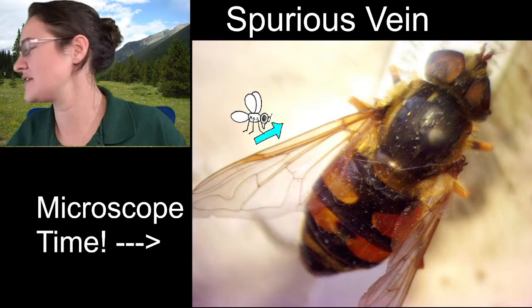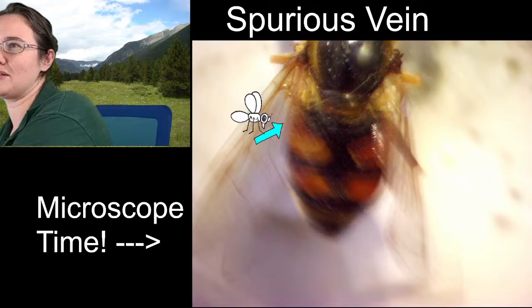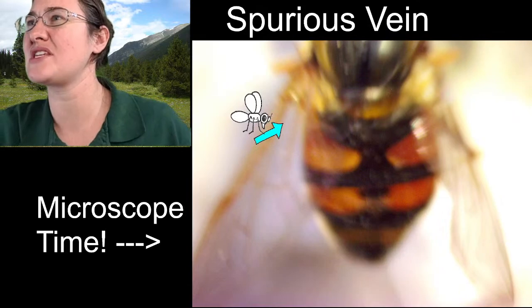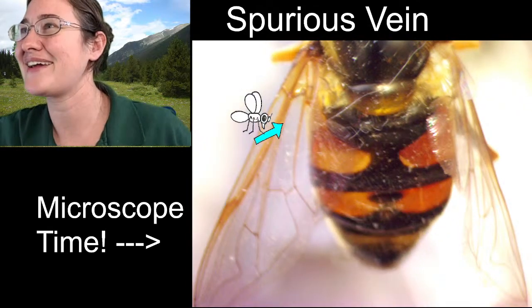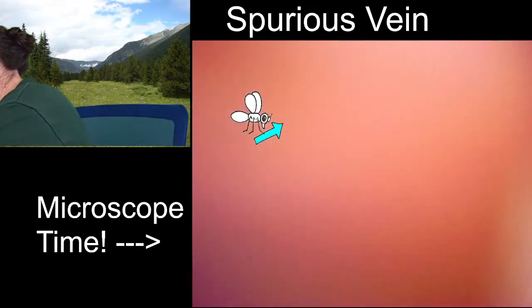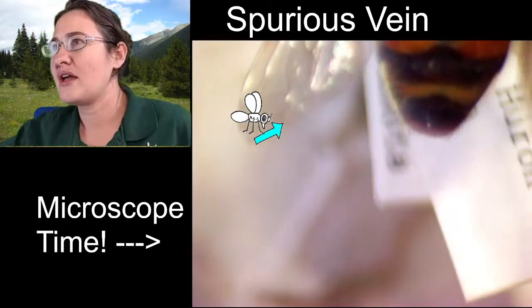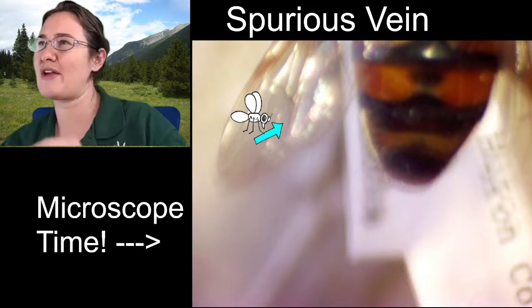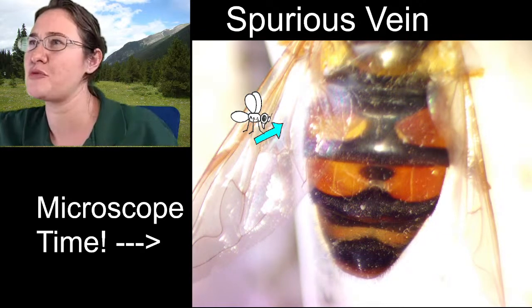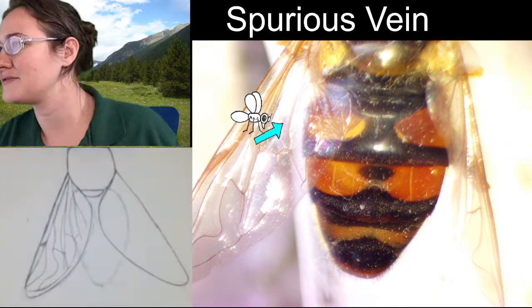All right, I didn't get that focused right. We're going to turn the specimen so we can see more of the abdomen. We're also going to be turning the specimen to see if we can see the halter. Because why not? I'm going to tilt the specimen forward a little bit, because the abdomen is tilting away from the microscope. If I tilt it this way, we are looking at it from a completely dorsal point of view, picking up the abdomen so that we can see it at the right angle.